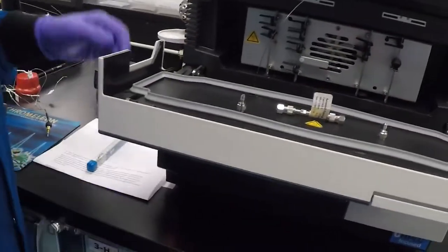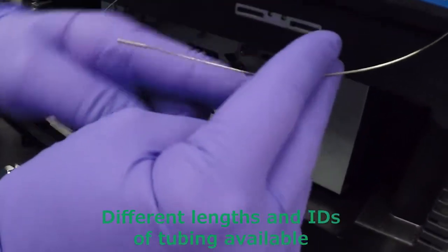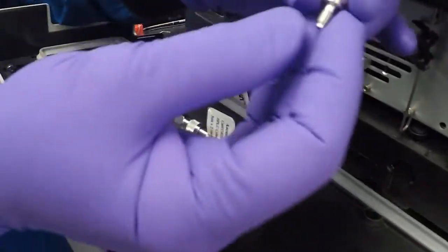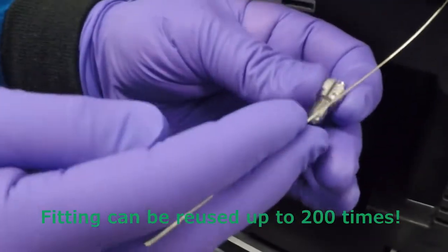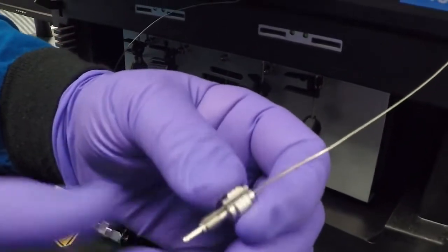You already have them installed in the LC. This is from the inlet — you can see a thinner part and then a thicker part where it goes into the column. There's a slot in the fitting that goes over the thin part of the tubing and then slides down over the thick part.